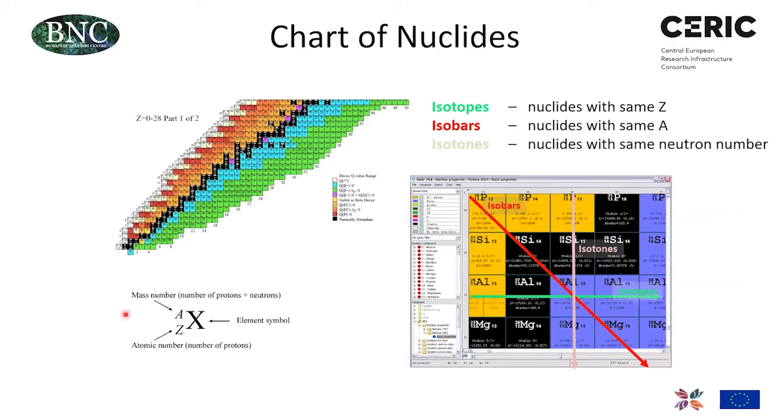As this is a nuclear analytical technique, we use on a daily basis this chart of nuclides, which is the periodic table of nuclear physicists, let's say.